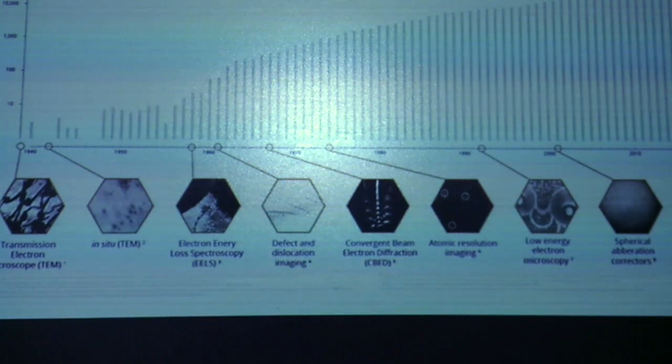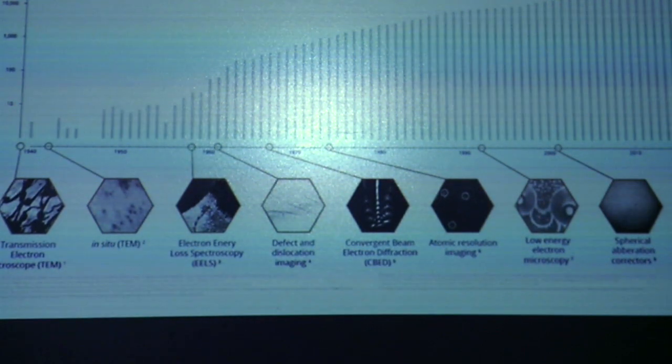What I'm showing here is a high-level overview of something anyone familiar with TEM will recognize from an outside perspective, which is that this technique has grown and is being increasingly adopted by researchers around the world, and that shows up in the publication record. If you go to Google Scholar and look at TEM and plot that on a log scale, this is what you'll see.